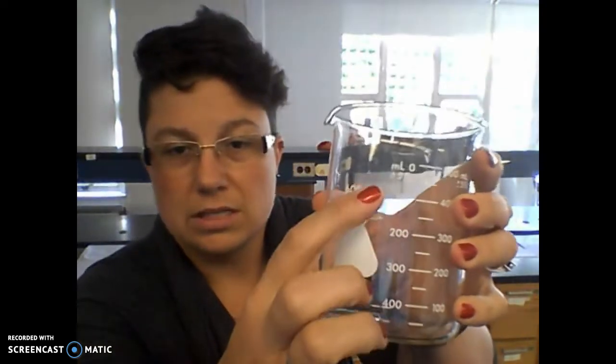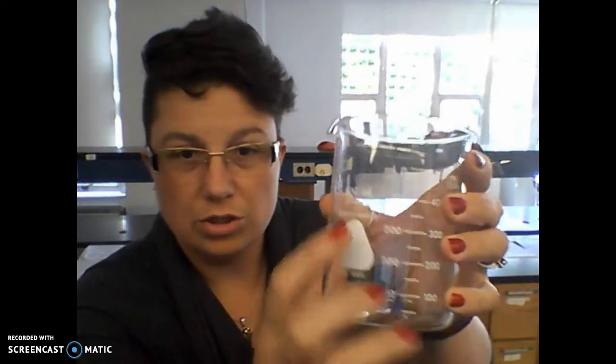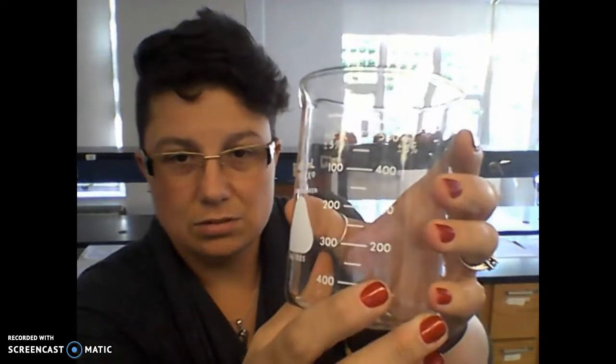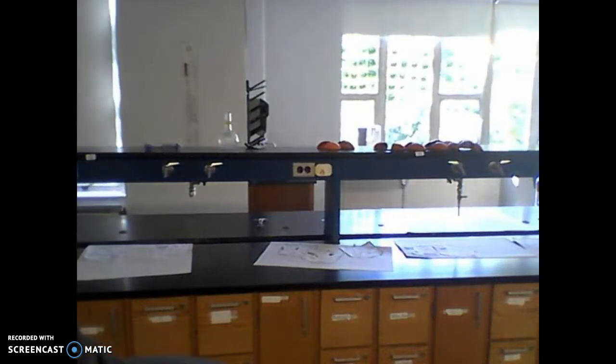The beaker — on the side it tells you what size it is. This is a 600-milliliter beaker, but the lines only go to 500 because 600 is right to the brim. So when I say pull out a 600-milliliter beaker, this is the one you have. The drawers all have the same equipment.